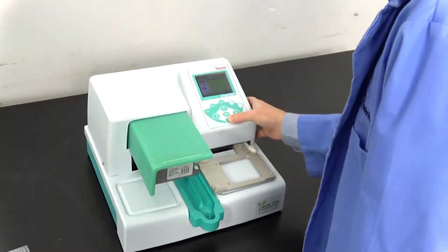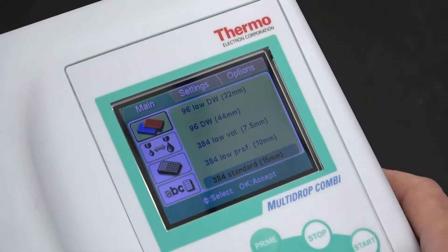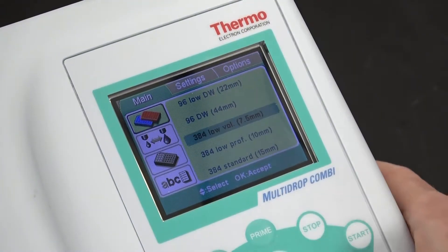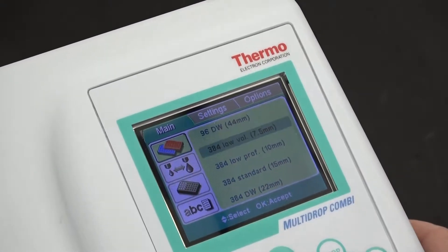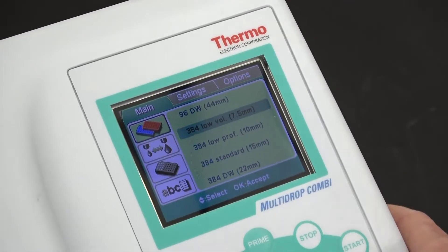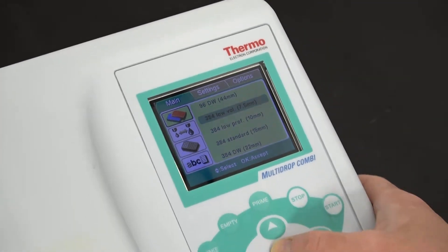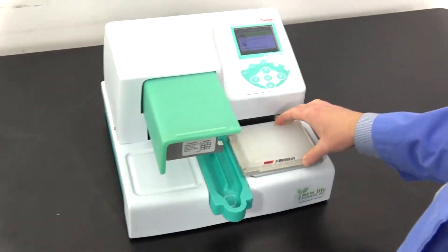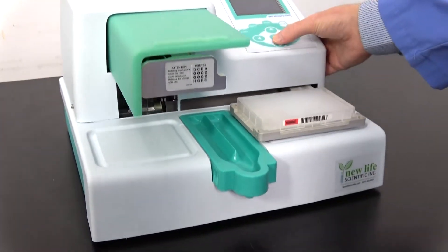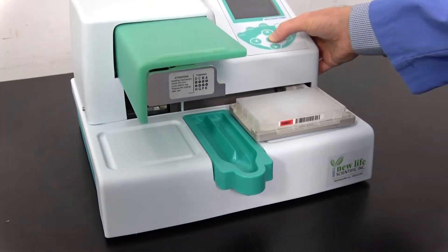Switching over to a different plate configuration is really simple. Just go to the plate selector and choose what you have. You'll notice this actually has deep-well options on it, so if you're using deep-well plates, this has you covered as well. We're just going to choose the 7.5mm 384 plate. And again, it's really simple — throw your plate in, prime it, and run. Before I do that, I'm going to give you a quick shot of the volume controls.